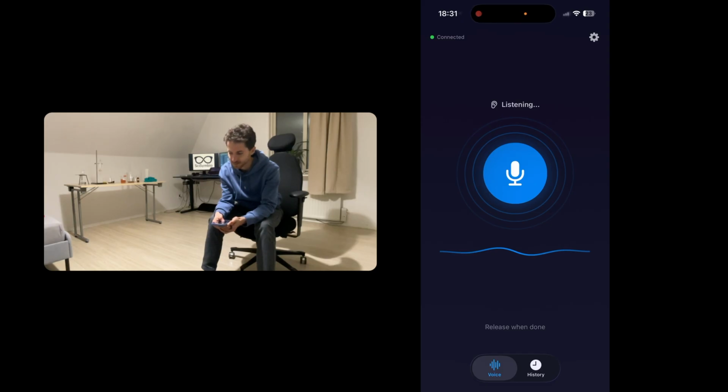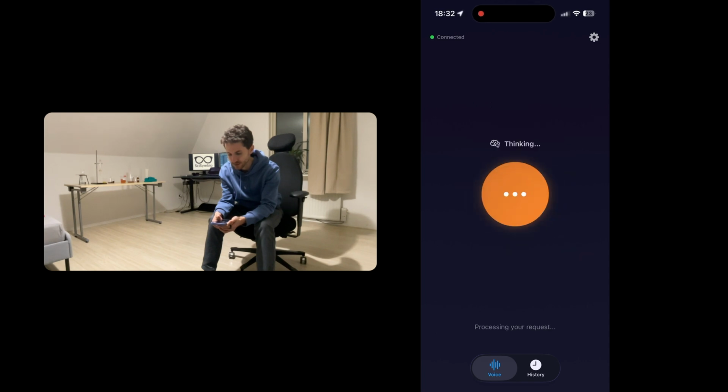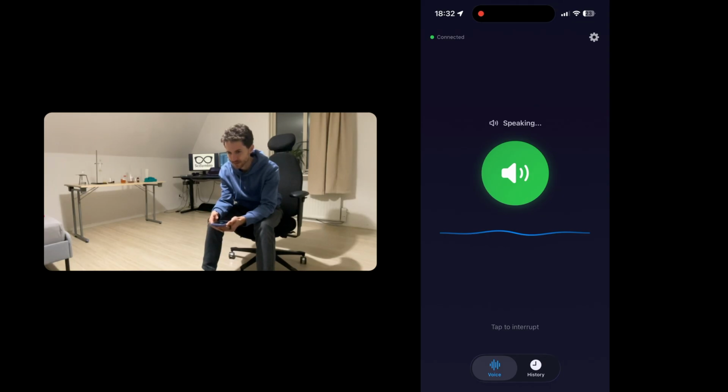Okay, I finished the procedure and I put the cells into the incubator right now. So what is happening? What should I do next? How long should I wait? The cells now need to incubate for 24 hours. After that, you'll perform the MTT viability assay to check for toxicity. Also, remember to discard the remaining organic phase into the waste flask.